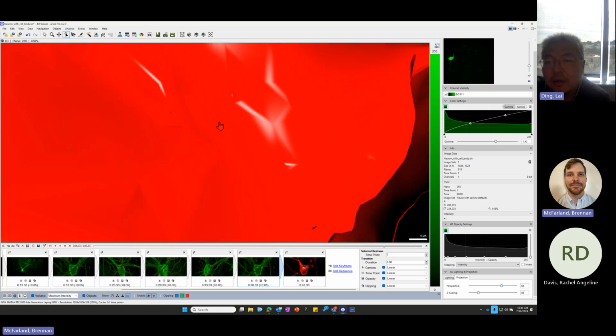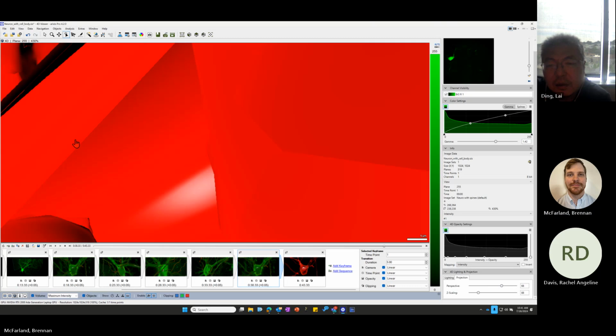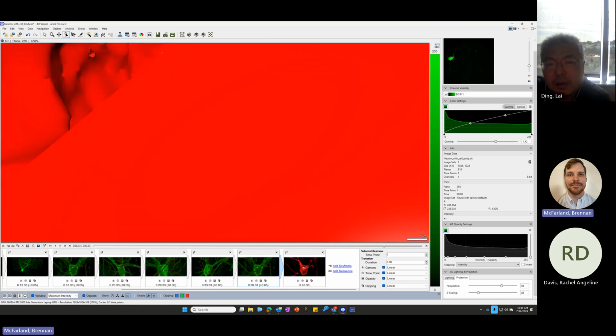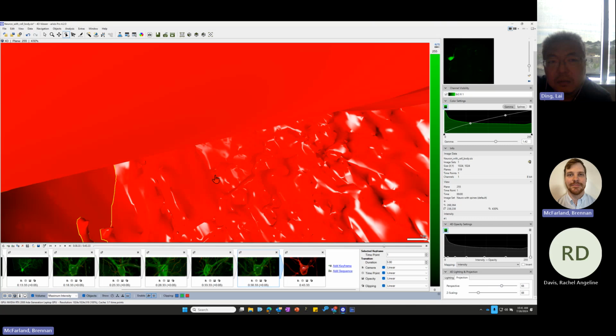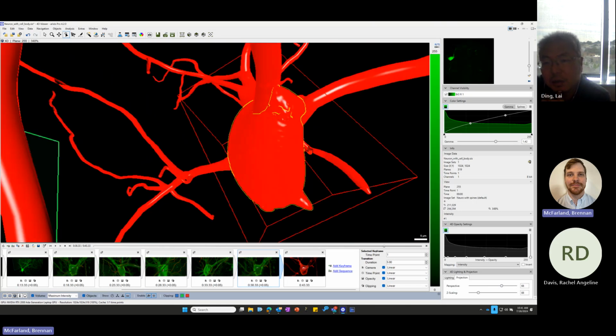And the reason I know that we're inside of it is because I can make out some of these fine ridges. This is all smooth right in here. And then as I go into it, I can make out some of these ridges, curves, everything that is shown here. I can make it out that we're now inside of it. But it's a little hard to kind of see where we are. So give it a try.